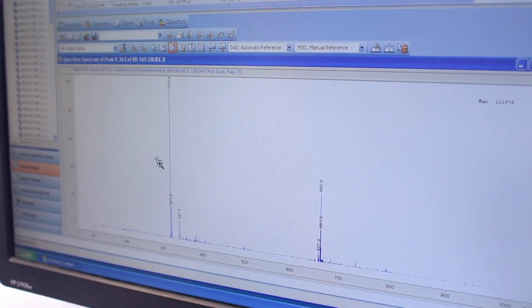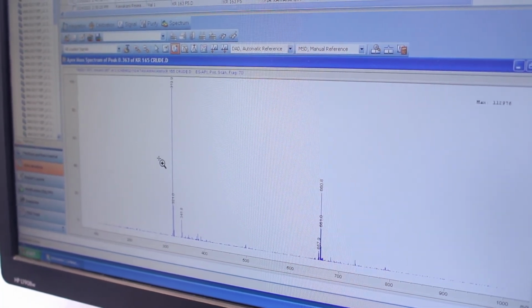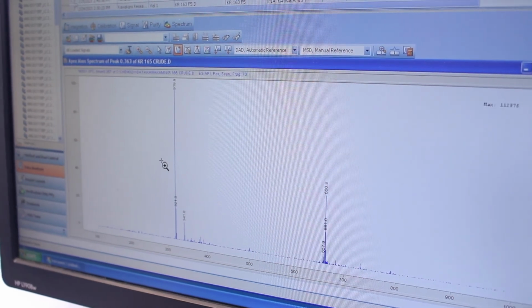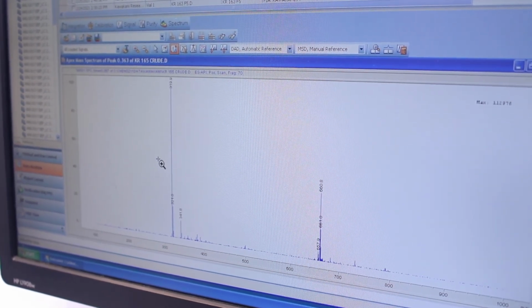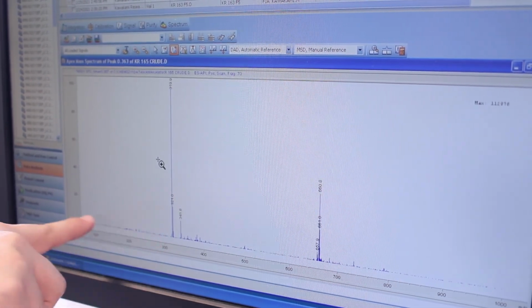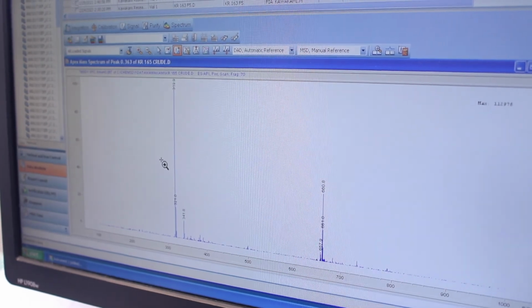And we also don't see any of the ion peaks for the starting materials, for the 9-anthracene methanol or the N-methylmaleimide. So if there were significant quantities of those, of leftover starting material, we would see them in this region here, but we don't. So I can say that this synthesis has been a pretty good success.